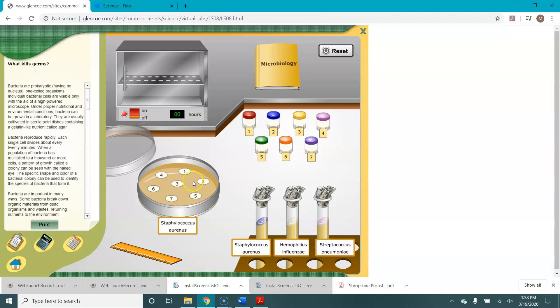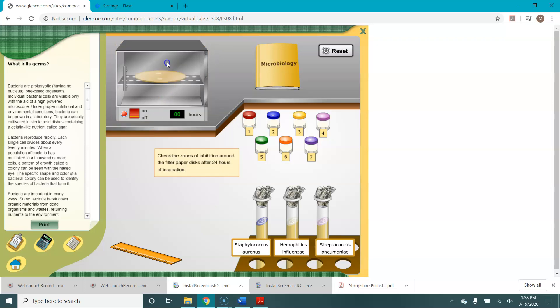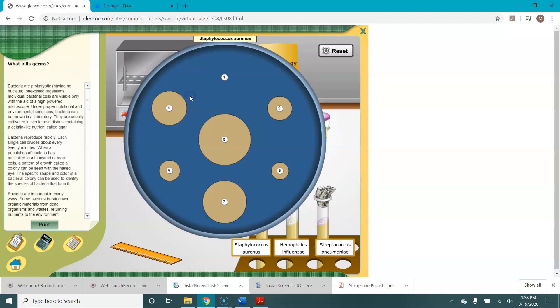We now need to put our agar plate into the incubator where it'll be kept at about body temperature. So we put it in the incubator by clicking on the incubator. You then need to turn the incubator on. It will run for an imaginary 24 hours and then you click the incubator again and you get to see your plate.